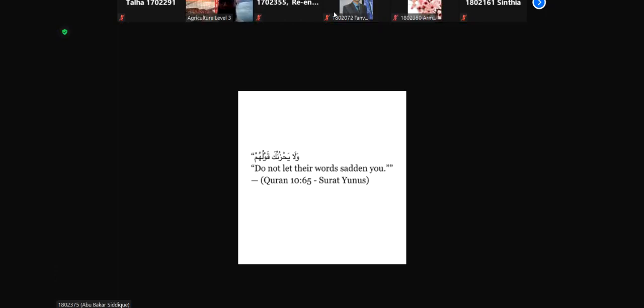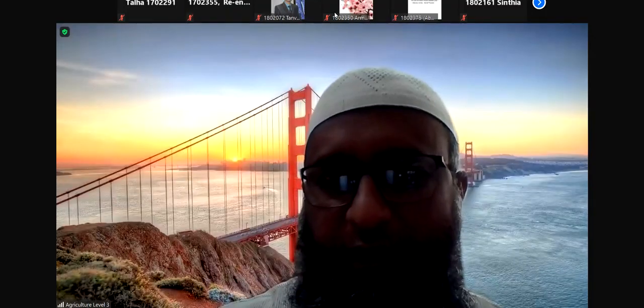Or you can write the reduction of soil moisture content. I can't hear you clearly.